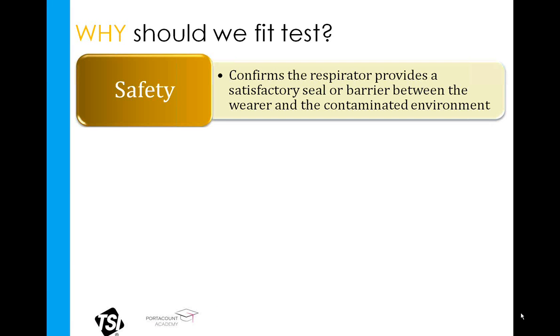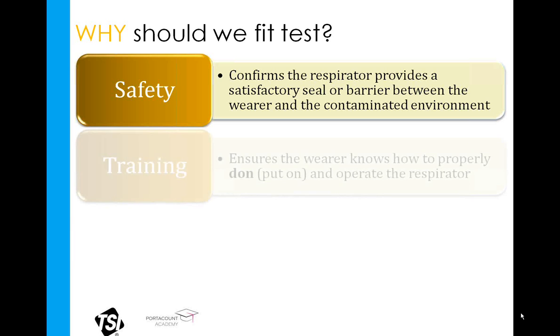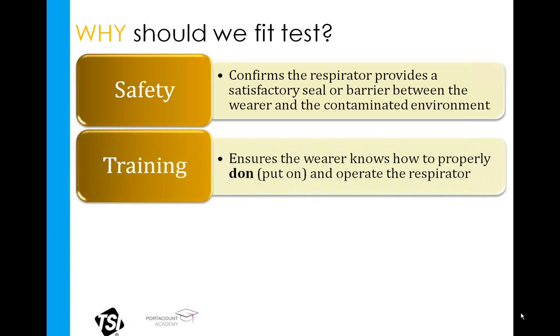So why should we perform fit testing in the first place? Or how can we justify setting this time aside to confirm if the mask fits or not? First, I think the most obvious reason is to ensure that the employees are safe. By fit testing the employee, we can know that the respirator is truly providing the respiratory protection that's needed. In addition to this, it can instill confidence in the user that the respirator is going to protect them from their hazardous environment. The second benefit gained from fit testing is the training purpose involved. This is your time as the fit tester to ensure the employee knows how to properly don and doff the respirator and how it should feel to the employee when they actually need to wear it.